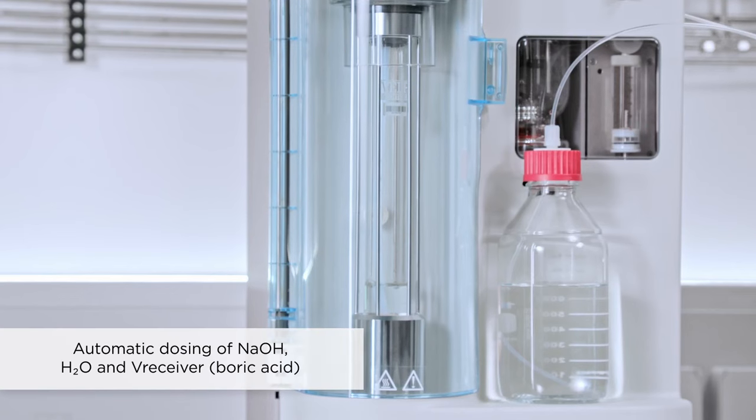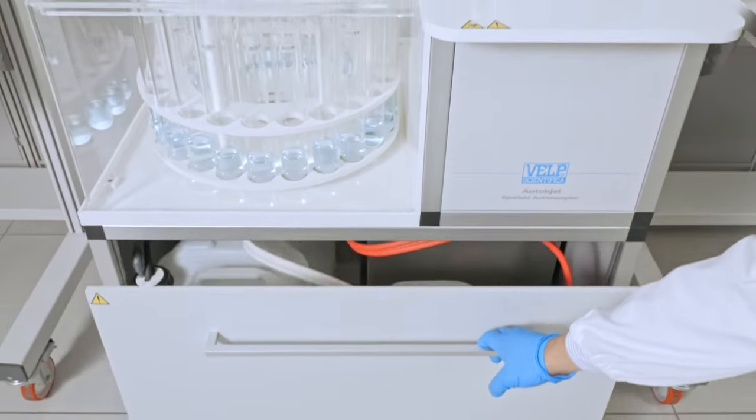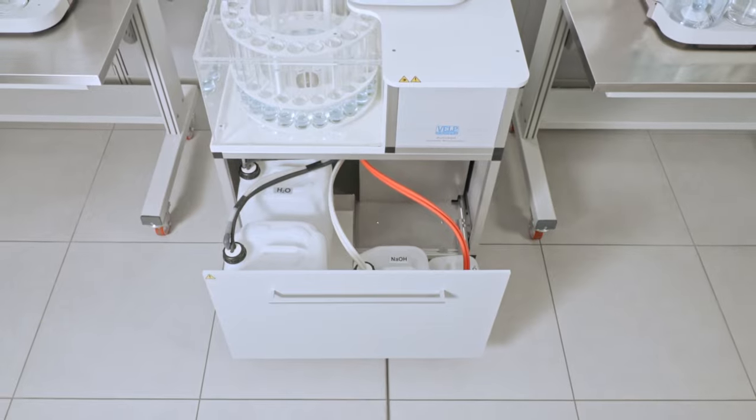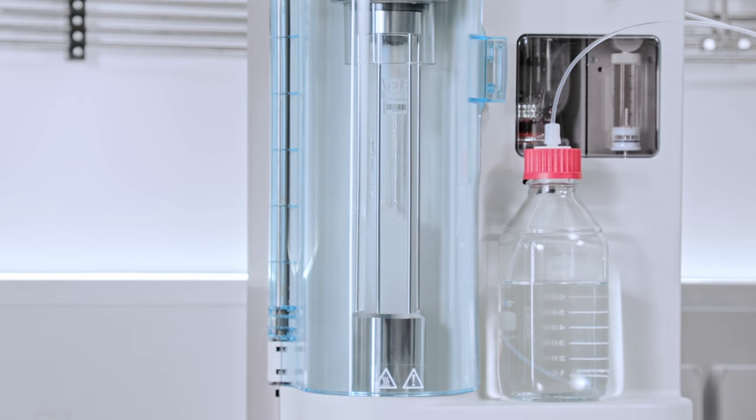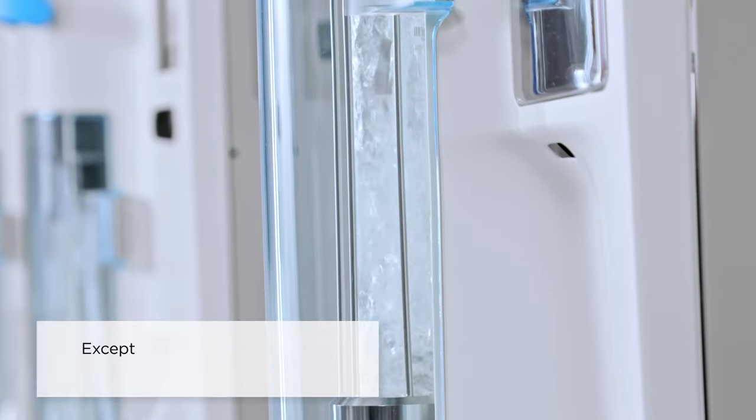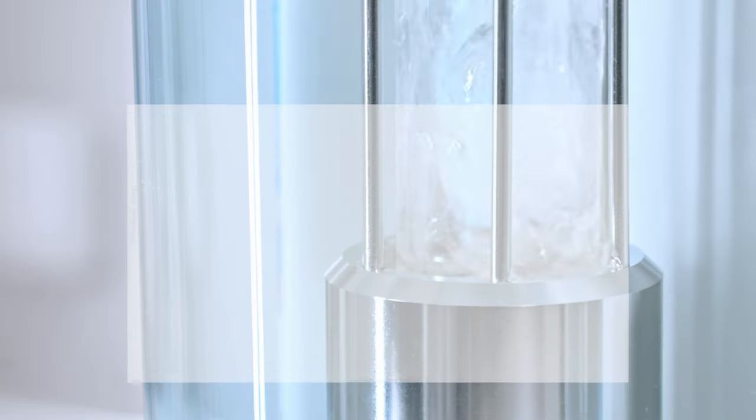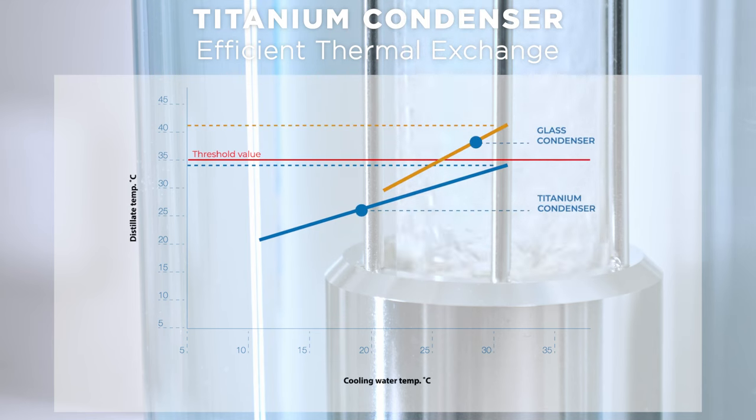The reagents are automatically dosed using high precision pumps and burette, providing a simple and safe operation for reliable analytical results. The powerful steam flow with variable steam output ensures maximum versatility for any application requirement powered by the exclusive VELP steam generator. The technopolymer splash head guarantees exceptional chemical resistance and allows ammonia to proceed for condensation. A unique titanium condenser guarantees efficient thermal exchange and low water consumption for a total nitrogen recovery.